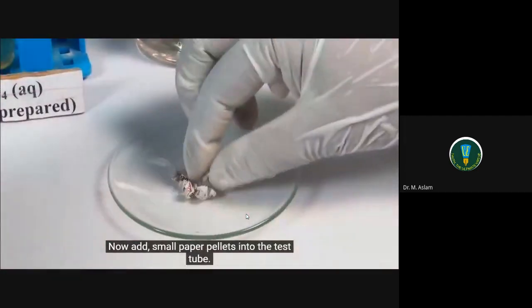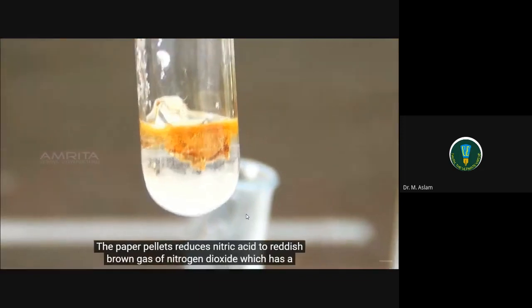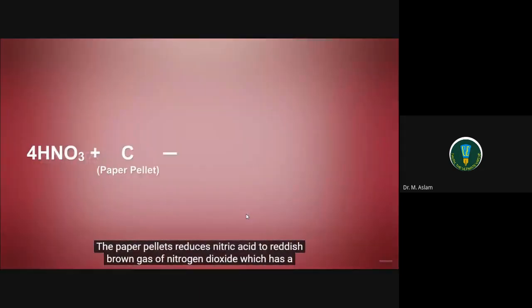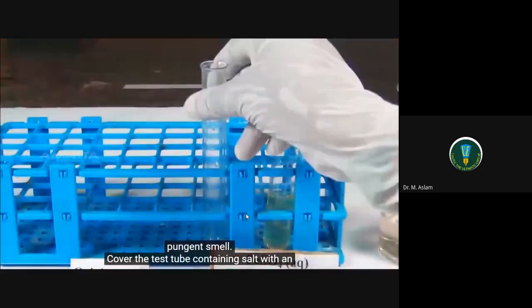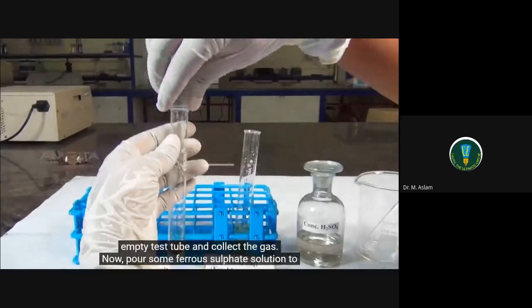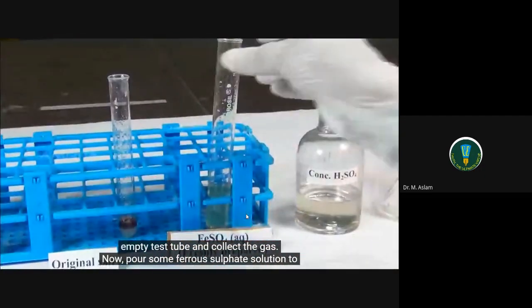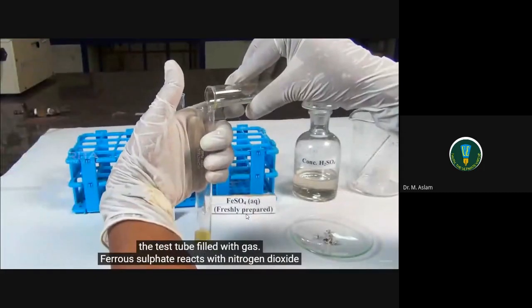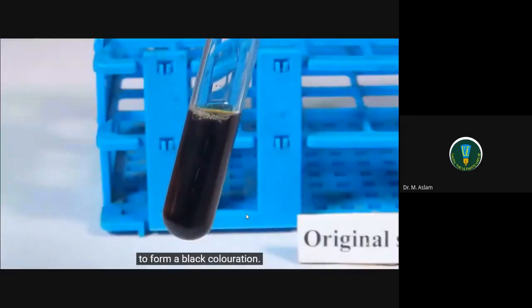Now, add small paper pellets into the test tube. The paper pellets reduce nitric acid to reddish-brown gas of nitrogen dioxide, which has a pungent smell. Cover the test tube containing salt with an empty test tube and collect the gas. Now, pour some ferrous sulfate solution to the test tube filled with gas. Ferrous sulfate reacts with nitrogen dioxide to form a black coloration.